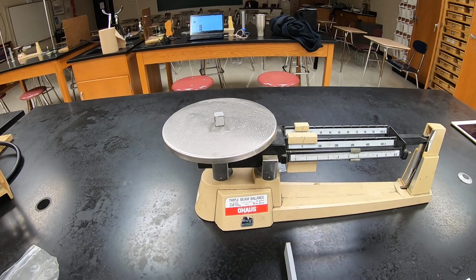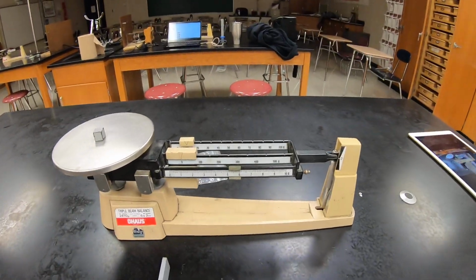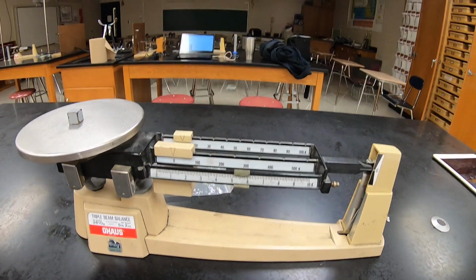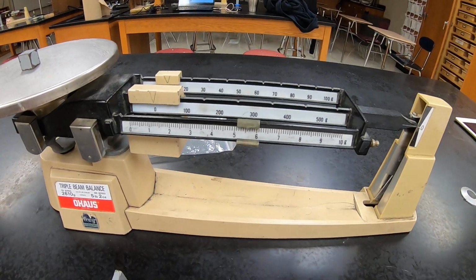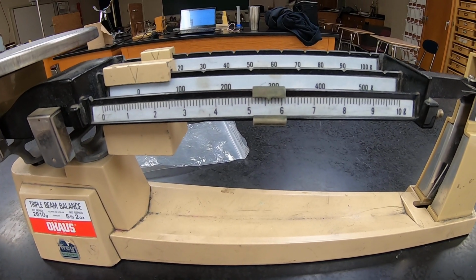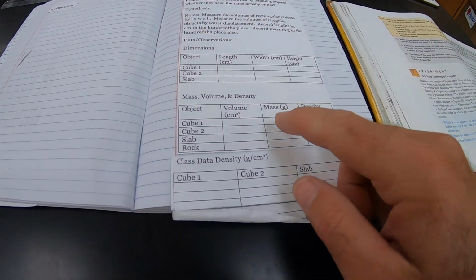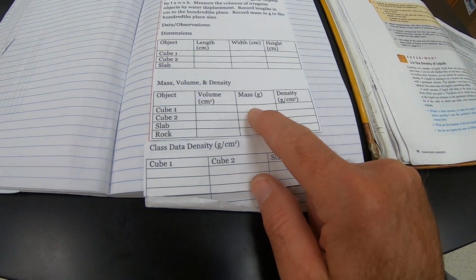And from my point of view, it looks to me like it's about 15, a little bit past the 0.6, so we'll call it 15.61. So that's what's going to go here for the mass of cube 1, 15.61.